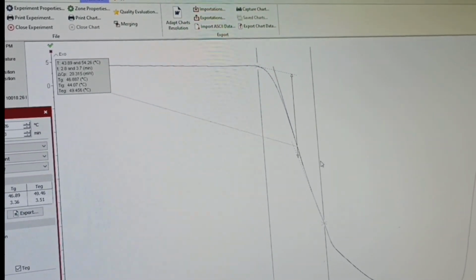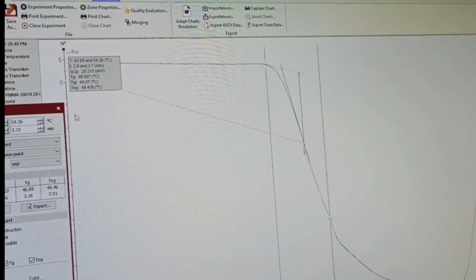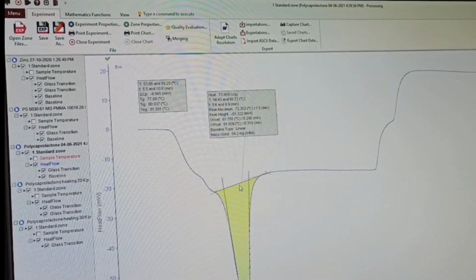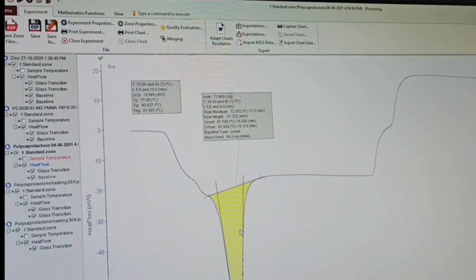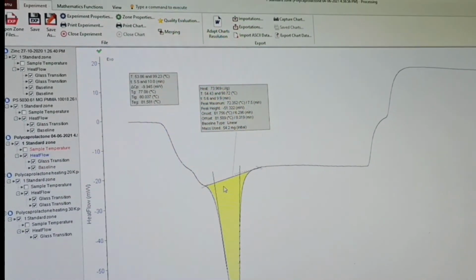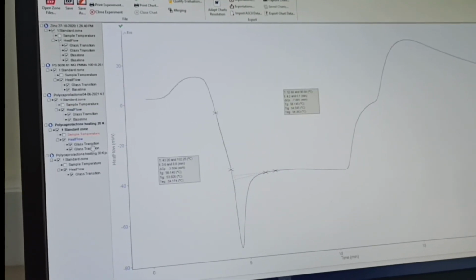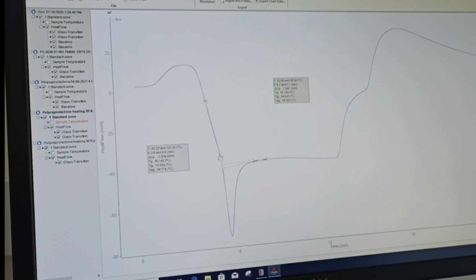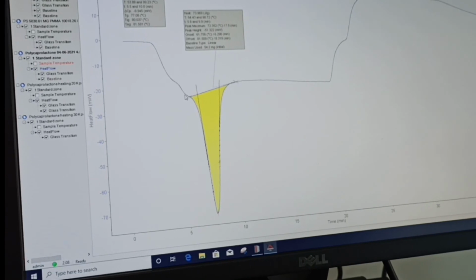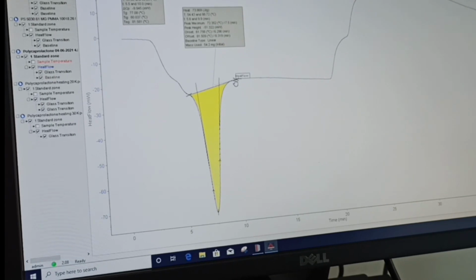So you are not advised to use an excessively high heating rate, and therefore a 10 heating rate is always advisable, or a moderate heating rate. It will give everything fine and no sample relaxation issue, and as a general rule you can find 10 is a good one. Otherwise you can go for 20 if you want a faster change, but still you see the nature of the curve here is distorted a lot compared to here. Here you find a change, then a decrease, the transition occurs and ends. So this is a good thing.